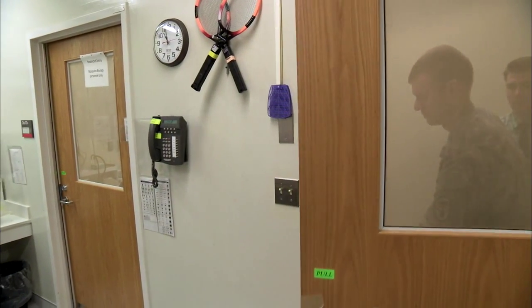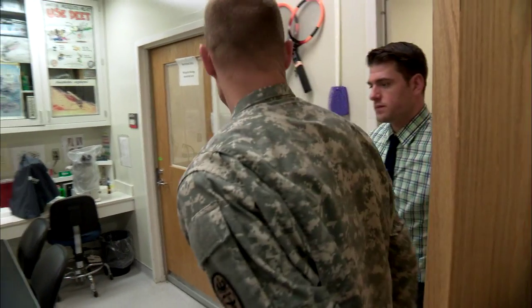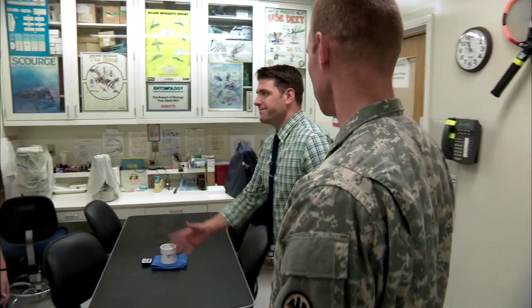Next, we went to the challenge room to see how they test their vaccines. We're now in the challenge room and I'd like to introduce you to Dr. Lindsey Garver from the Science Center Department. She'll explain the process.